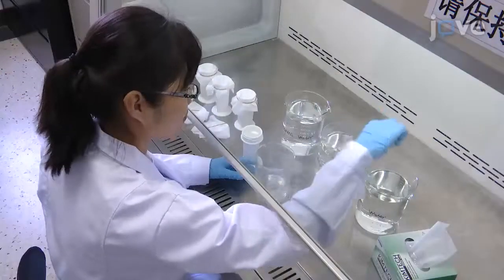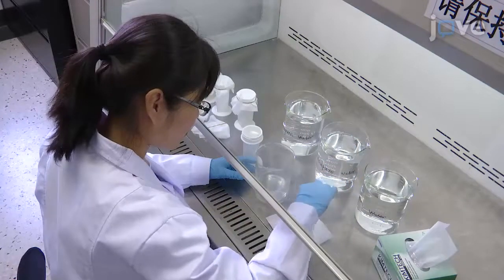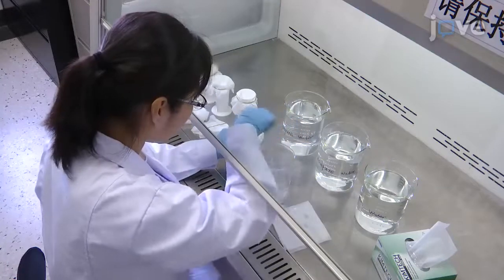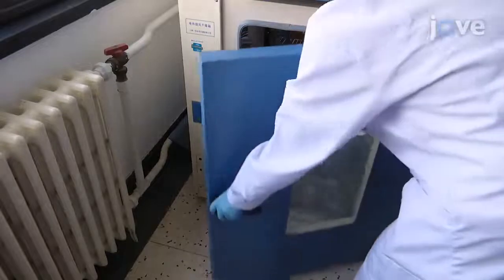Then wash each coverslip extensively with ultra-pure water, use paper to dry the coverslip from its edge, and place the coverslip into a staining jar. Thoroughly dry the coverslip in a 110 degrees Celsius oven.